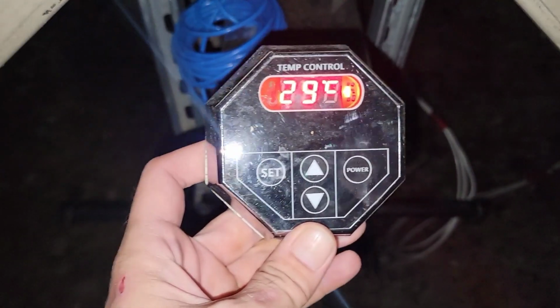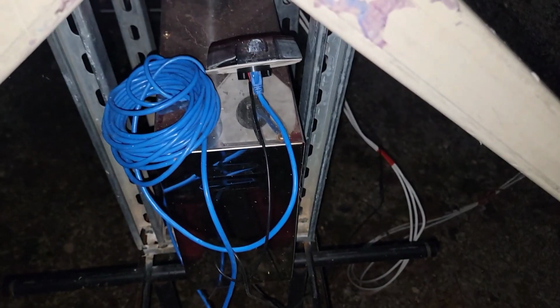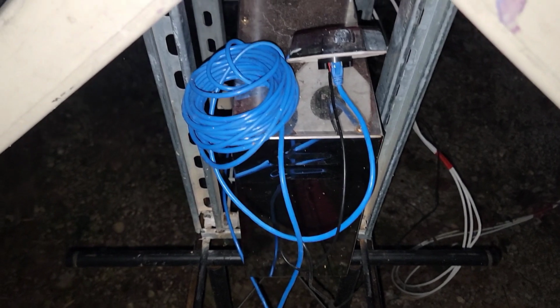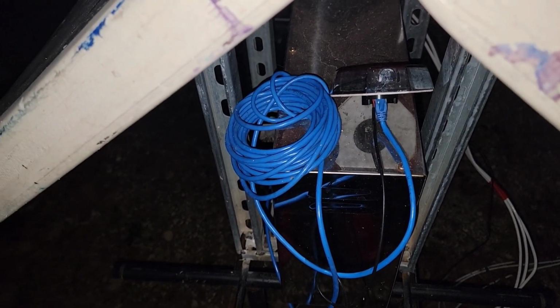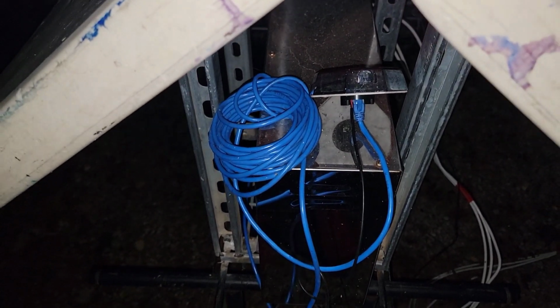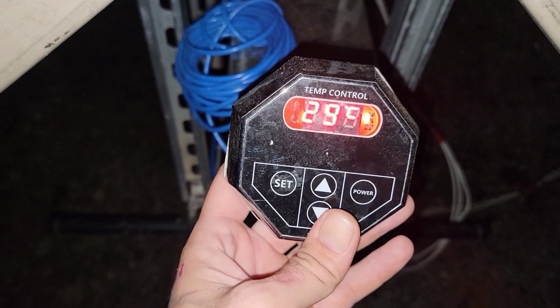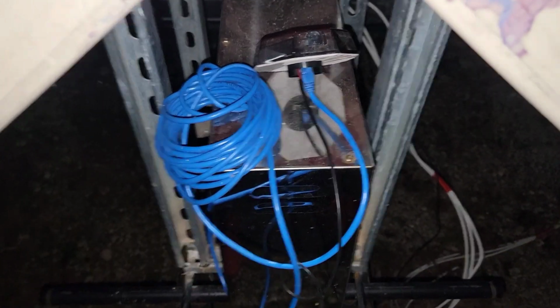All right, so now it's been about 45 minutes, and if you notice, our core temperature is at 29, starting to come up from 19, which means our outside temperature is probably around 35 to 40 Celsius. So when our core temperature gets up to 55 Celsius, our surrounding substrate will probably be around roughly 70 Celsius, maybe a little bit less. Therefore, when this turns off, the core temperature will balance with that outside, and this will probably start reading around 80, and it'll stay off for about 2 hours. But the core temperature will be maintained, which is what we need. You're not pasteurizing unless you're maintaining the core temperature. Anything else is bullshit. Don't let nobody fool you.